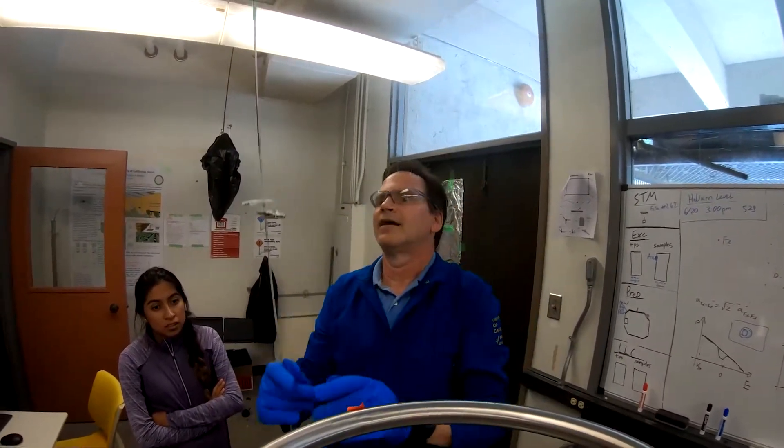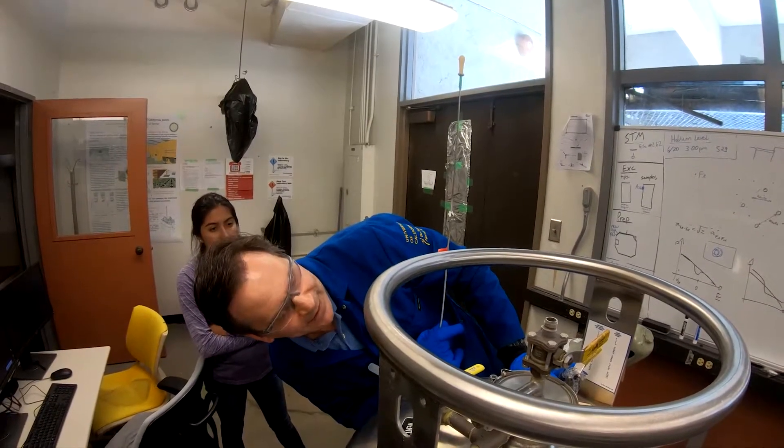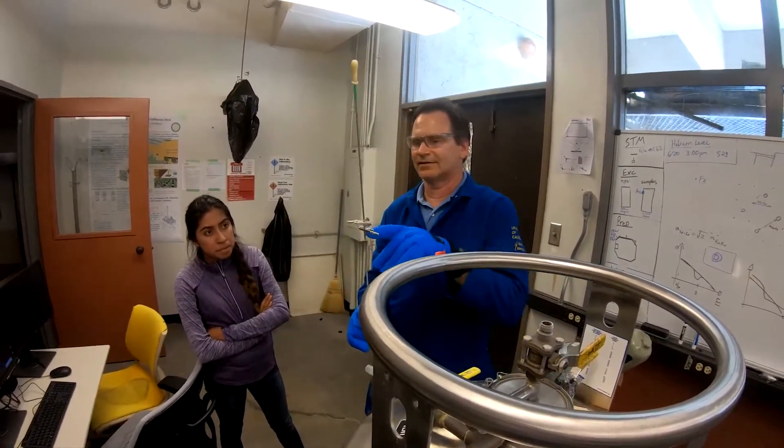Dipstick comes off your dewar, and then you can measure that difference. And one inch is one liter on this scale, so there's less than a liter in this dewar. And that's how you dip a dewar.